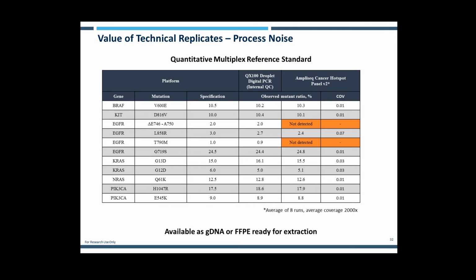So as I introduced earlier, technical replicates are usually considered a repeat analysis of the exact same sample. Here, what we're using are the same sequencing libraries sequenced on the same machine using the same parameters. When you run these types of replicates during your initial pipeline development, or when you're evaluating new protocols or new sample types, you'll obtain information on the degree of noise associated with your pipeline. However, most laboratories would prefer not to use precious patient samples for these types of upfront experiments.